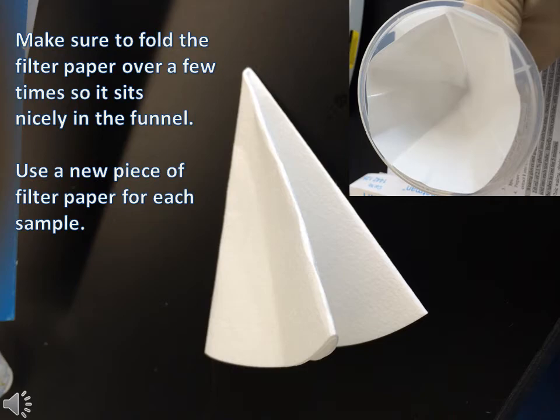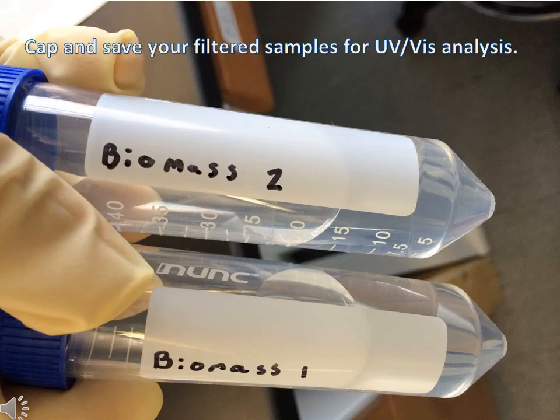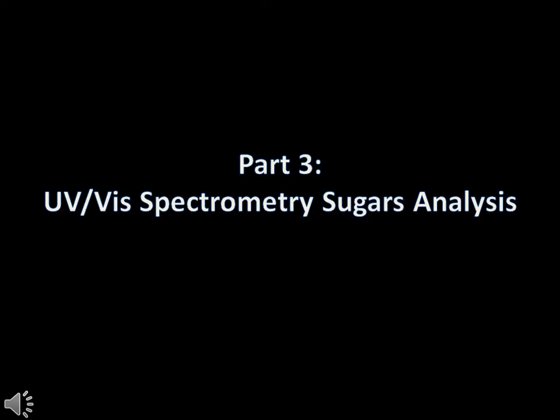Use a new piece of filter paper for each sample. The process of gravity filtration is rather slow, so you can end it early after you've collected only a few milliliters of your sample. Cap and save the filtered samples for UV-Vis analysis later.